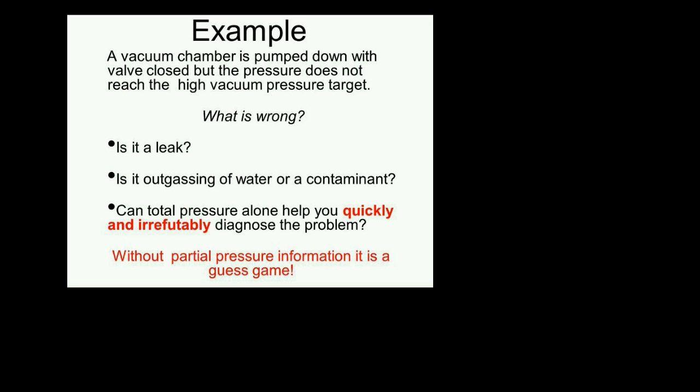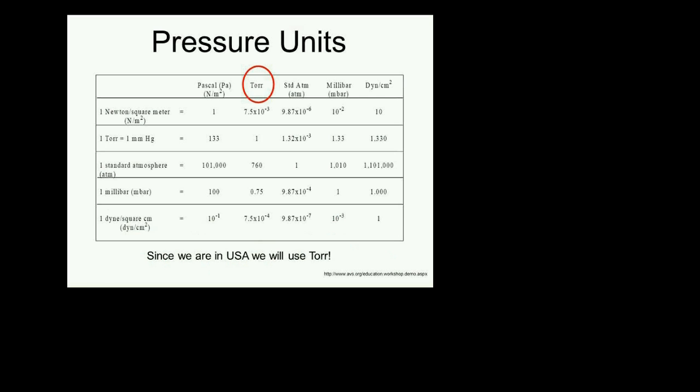So this is why I suppose all of you are here. You all realize the power of knowing not only the total pressure in a vacuum system, but also the partial pressure for the individual gases.